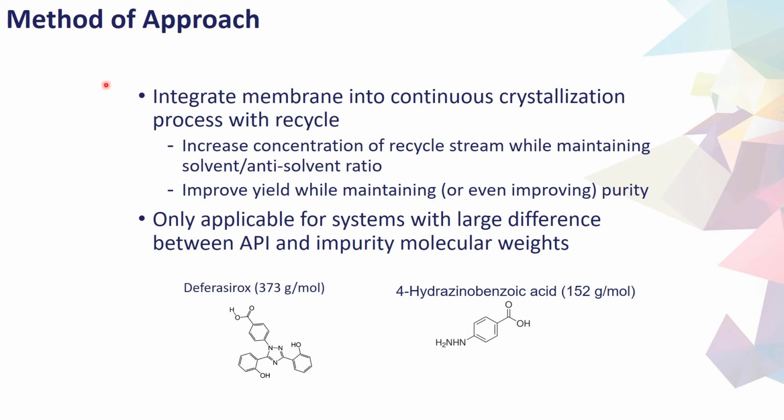So in order to demonstrate that the integration of nanofiltration can allow mother liquor recycling techniques to improve yield and purity in continuous API crystallization that rely on anti-solvent or mixed solvent systems, an API example crystallization was conducted. It was a combined cooling anti-solvent crystallization from a mixed solvent system in order to isolate the API deferasirox and purge an impurity, 4-hydrazinobenzoic acid, which results from its synthesis, down to very low levels.